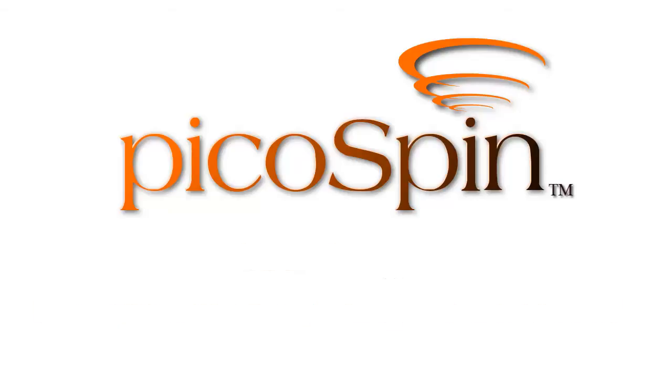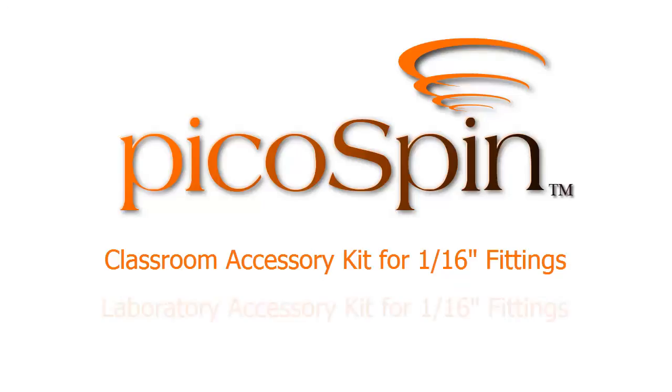In this video, we'll look at the general procedure for injecting liquid samples using accessories from the Classroom Accessory Kit for 1/16th inch fittings and the Laboratory Accessory Kit for 1/16th inch fittings.